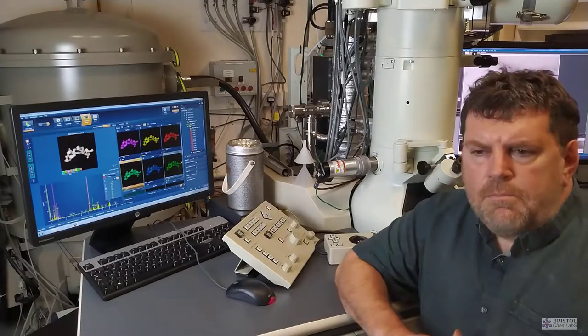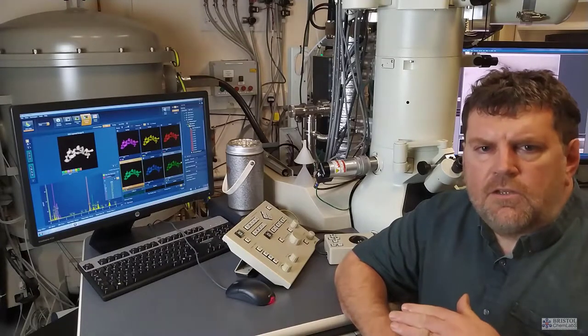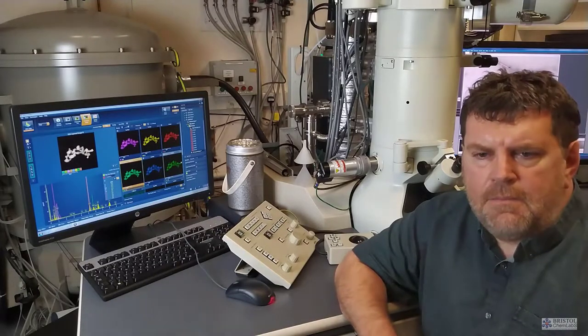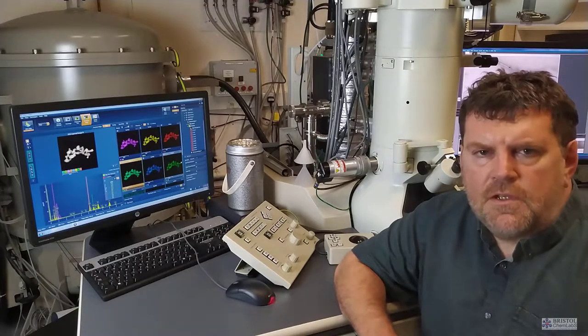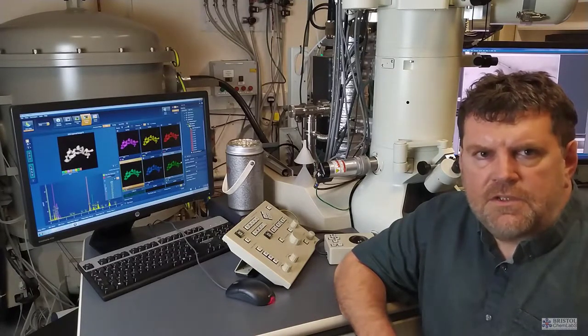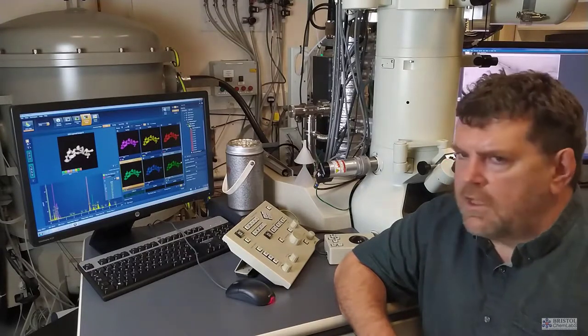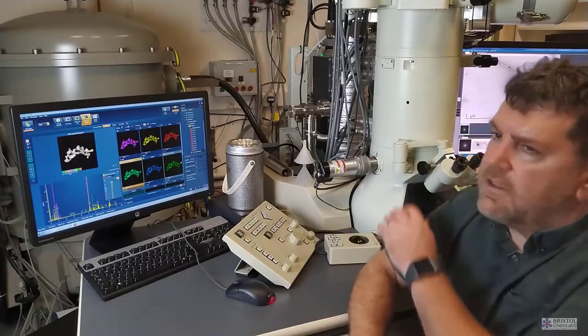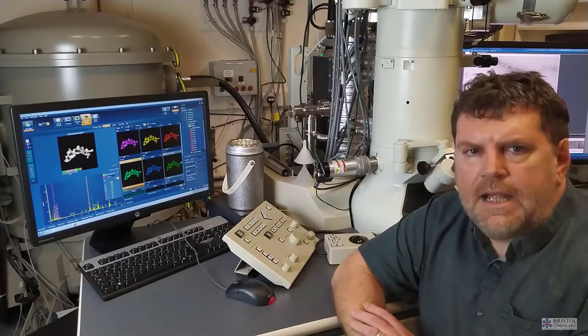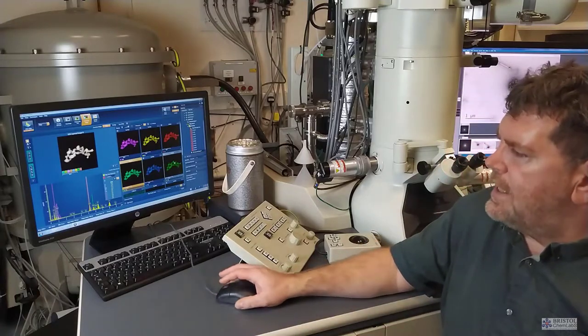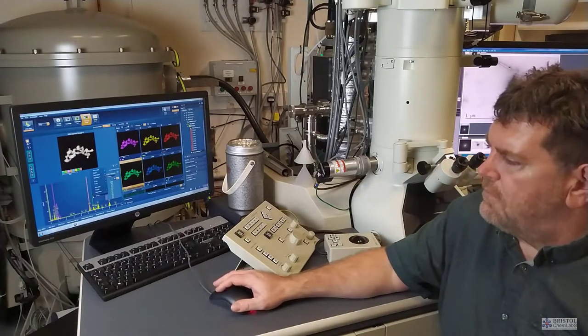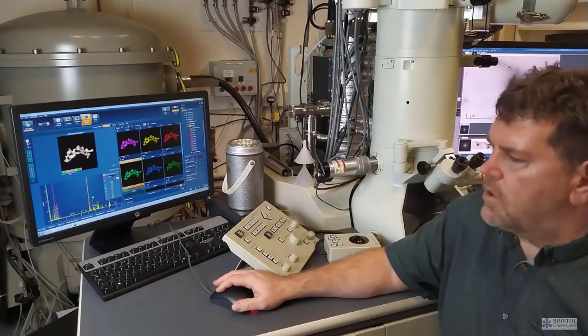The electron beam is still interacting with the sample. We're predominantly interested with the electrons that are transmitted through the sample to generate an image. But X-rays are still being scattered from the surface of the sample, and there are still secondary electrons being generated. So we can collect the X-rays and use them to get a chemical signature of the material in the same way as we can on a scanning electron microscope. So we've got a similar detector attached to the column of this transmission electron microscope, which allows us to analyze materials, get the element composition, but also map the distribution.